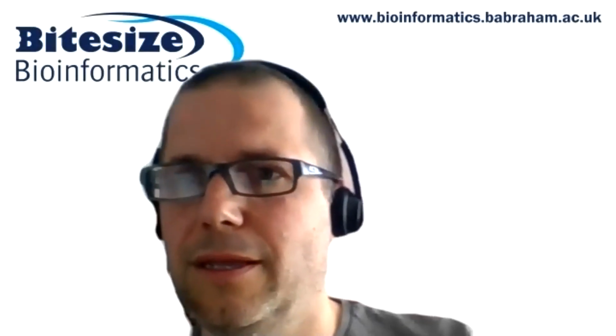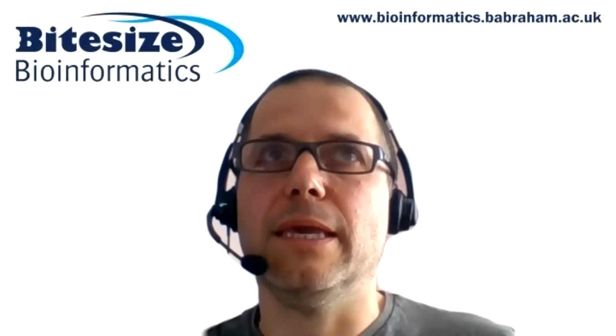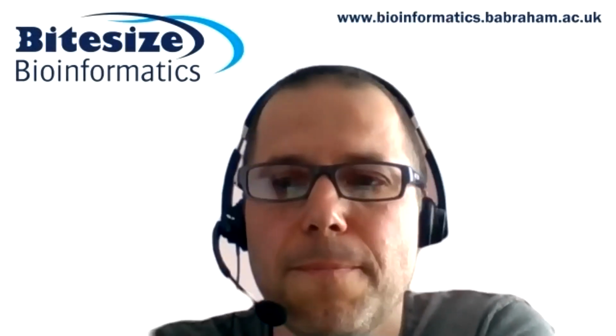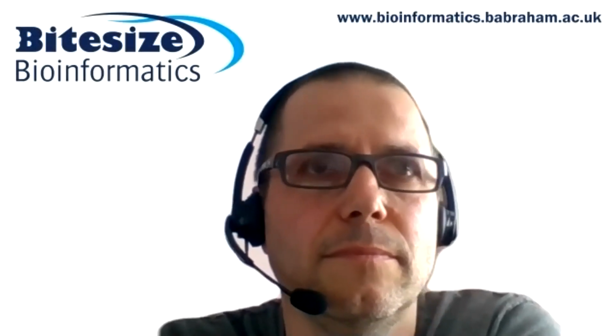Veronica. Hi, thank you. I'd like to just go back quickly to the data groups and replicate sets, if that's okay. So there are a few tools that allow us to merge BAM files from things that were sequenced on different lanes. Is there a particular advantage to doing or not doing that and then putting things in data groups?